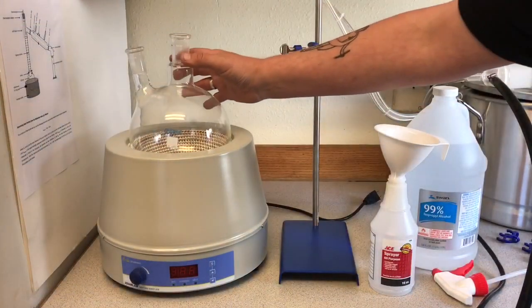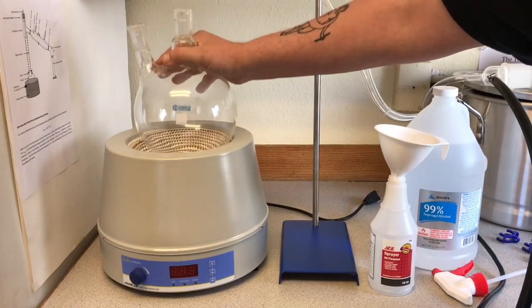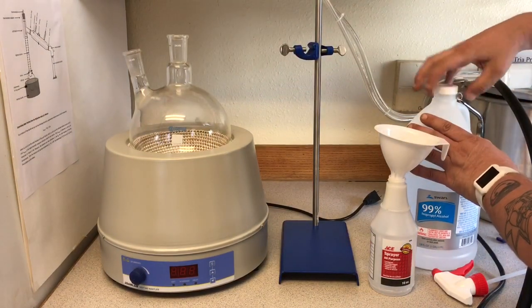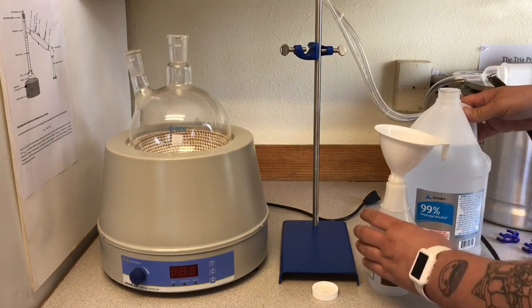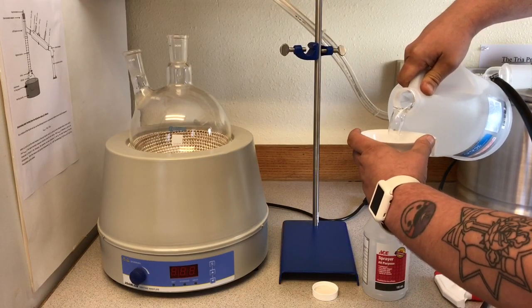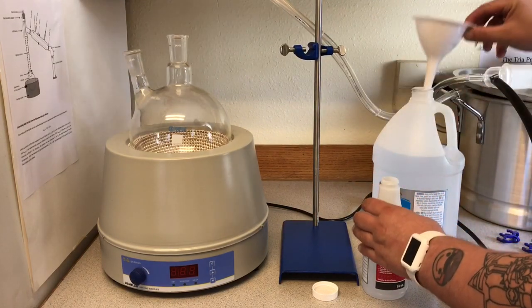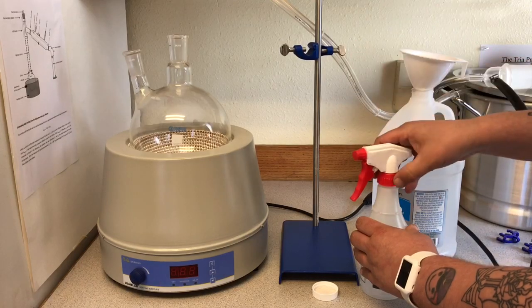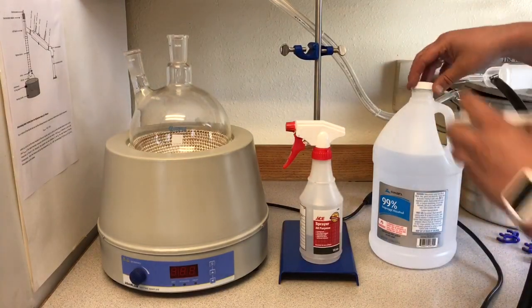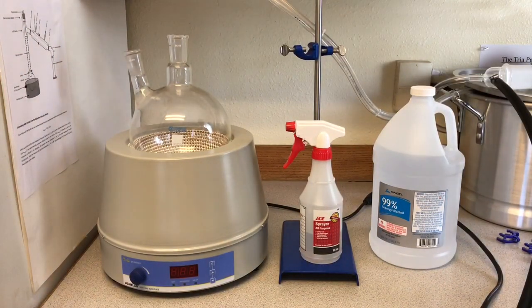To begin our setup, we'll start with our large round bottom flask. So in this case, we'll be using a 2-liter round bottom flask from Steamroller Extractions. To keep the glassware clean, I like to use 99% isopropyl alcohol, and you can find this at your local hardware store. I just pour a little bit in a clean spray bottle, and I use my spray bottle to spray out each of the pieces as we go. So we're going to make sure that all the glassware is clean, and we're also going to make sure that all the joints are properly lubricated with our high vacuum grease.